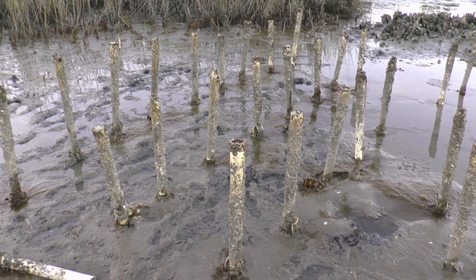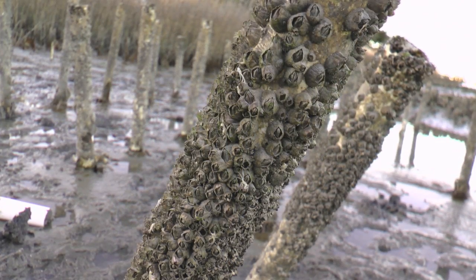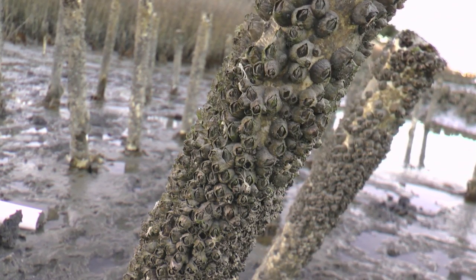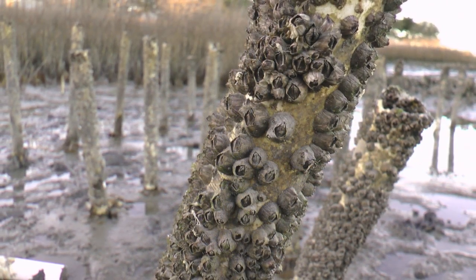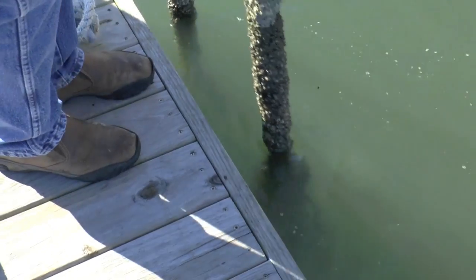In the summer, barnacles actively reproduce. However, in the winter, barnacles are too cold and hungry to reproduce. Therefore, special measures have to be taken to guarantee a readily available supply of larvae. PVC pipes are driven into the ground in the spring and left there for barnacles to settle on until they are needed in the winter.